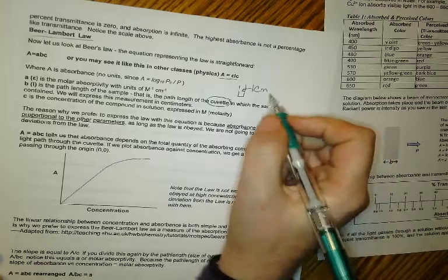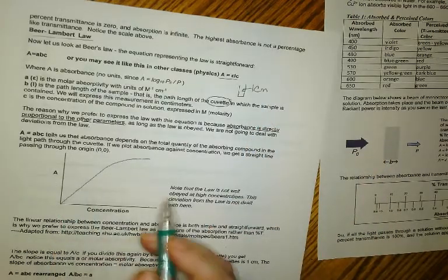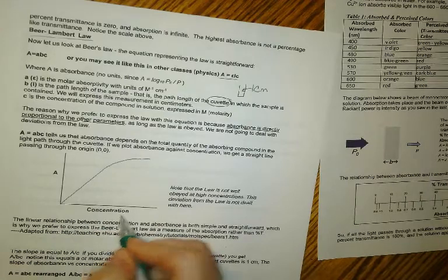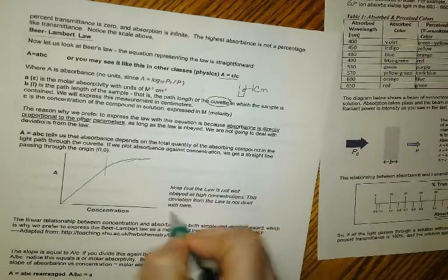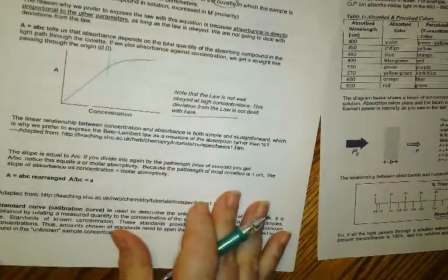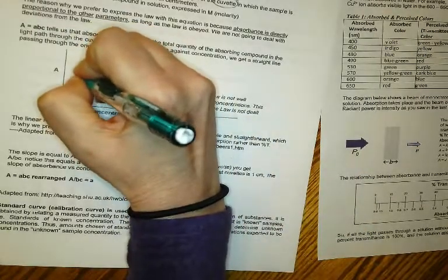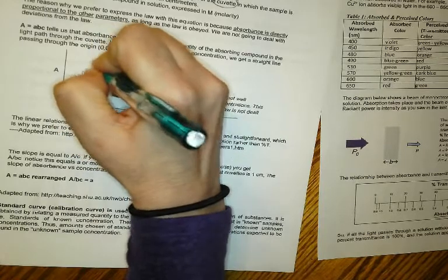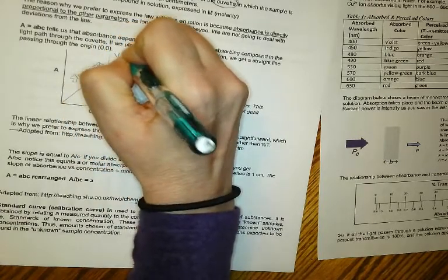And that becomes important because if I graph absorption versus concentration, and that would be cut off here, we usually don't do it at higher concentration. Okay, we're not going to deal with that in our class. If I do that, the slope equals our molar absorptivity if I have a 1 centimeter cuvette, okay?